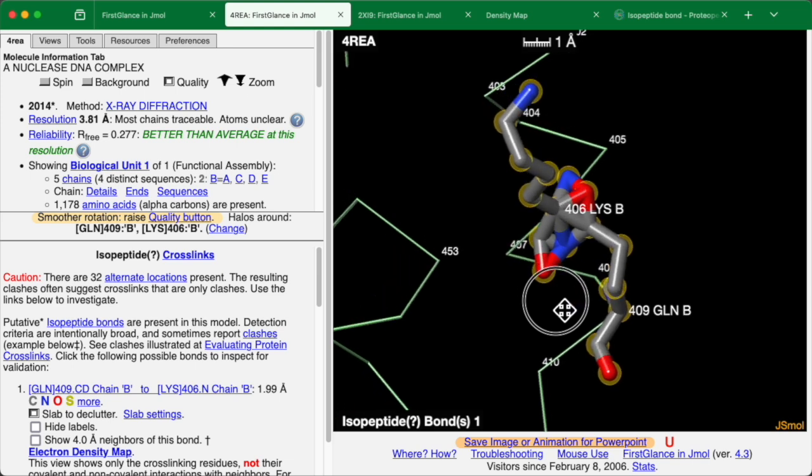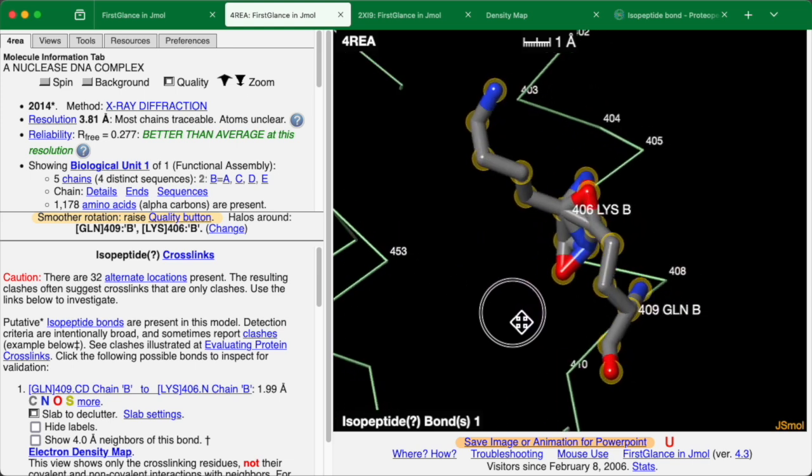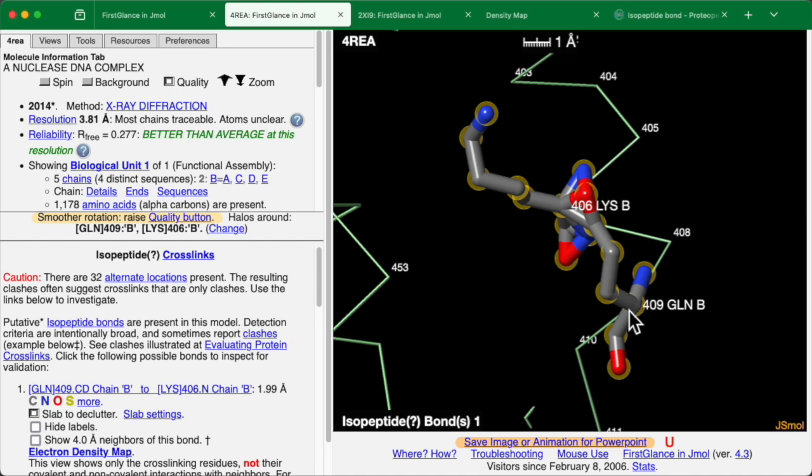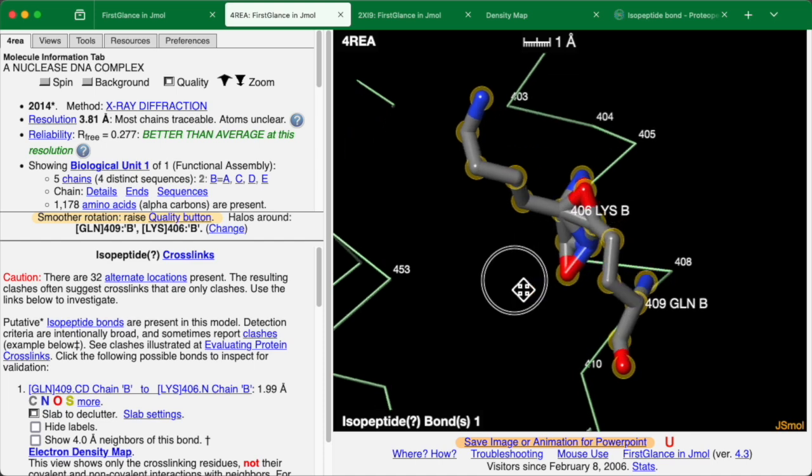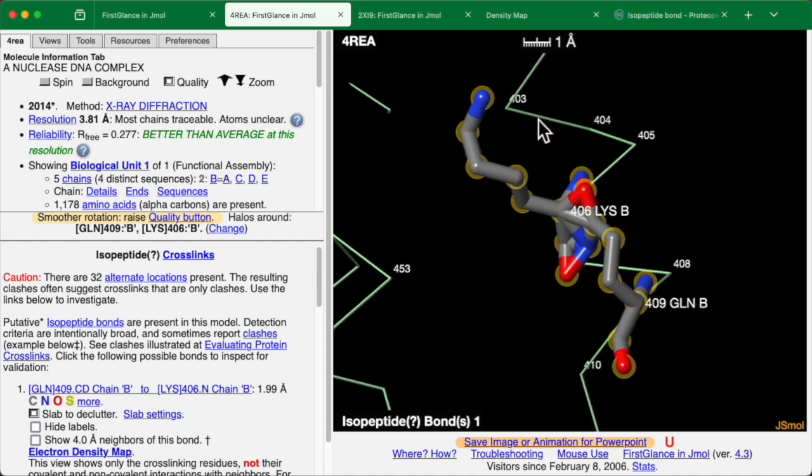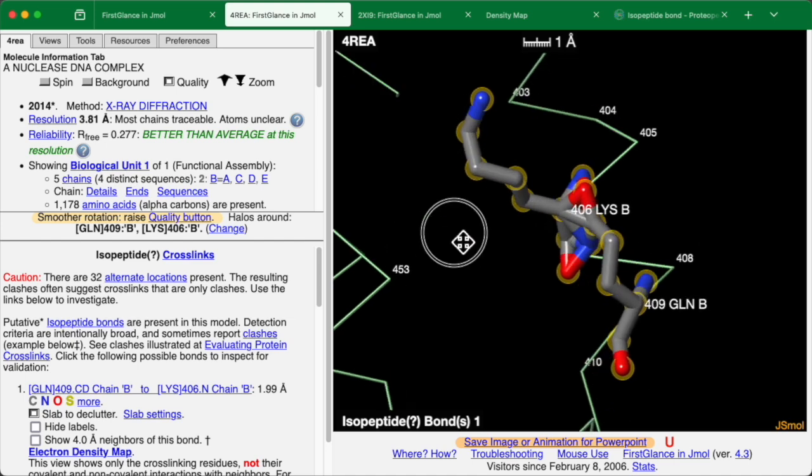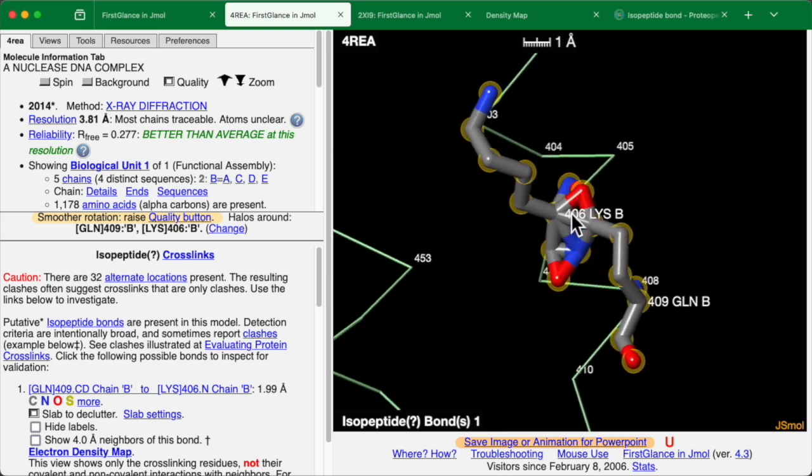Between the... Well, first of all, it's not even between side chains. Here we have a glutamine. And it is the side chain of the glutamine. But it clashes with the main chain atoms of lysine-406. And here's the side chain sticking out. So already that makes no sense at all. Furthermore, you see a kind of wad of unrealistic covalent bonds here.